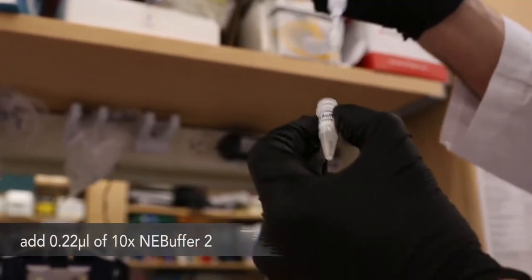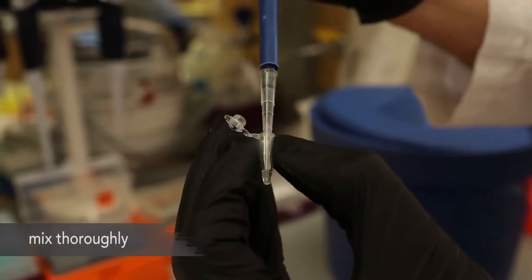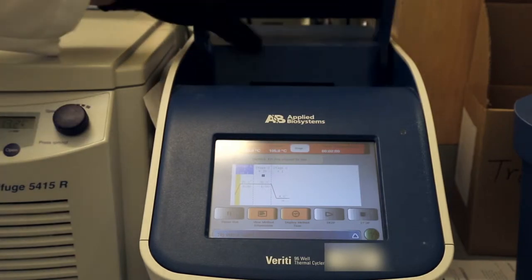Finally, add 0.22 microliters of 10x anybuffer 2. Pipette to mix thoroughly. Place this mixture in a thermocycler and subject it to the following protocol.